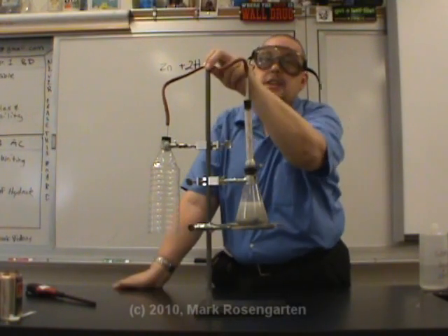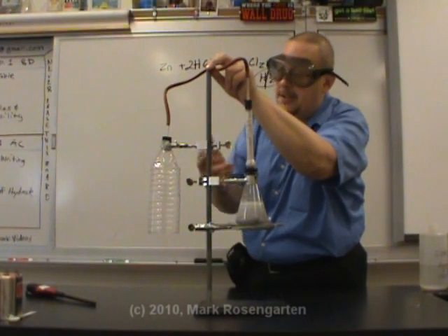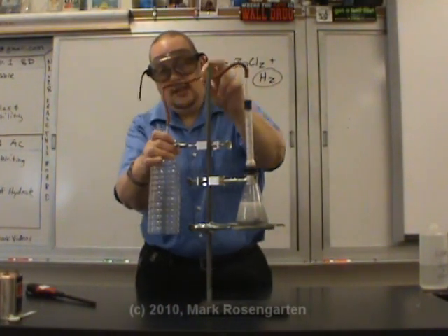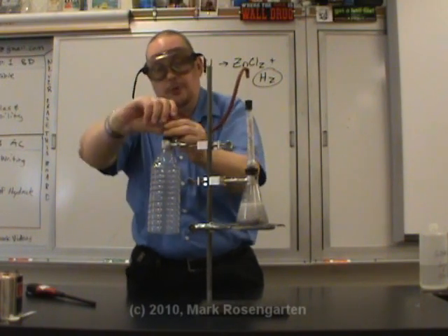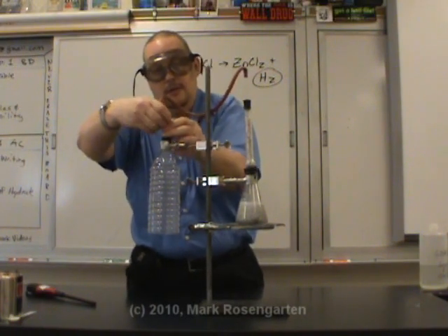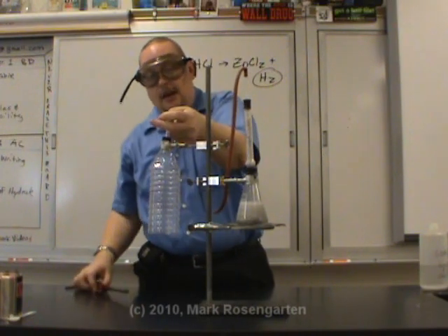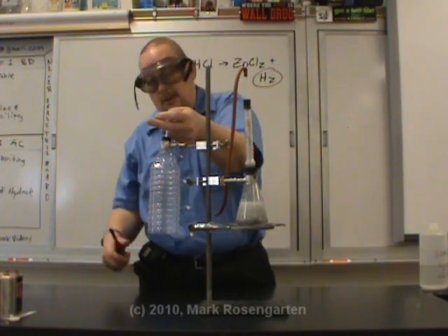At this point we should have generated enough hydrogen to completely displace the air inside of this. So we're going to remove this rubber tube. Put my finger over top like that. Now hydrogen being less dense than air, it's going to stay in this bottle. So I'm going to light the top.